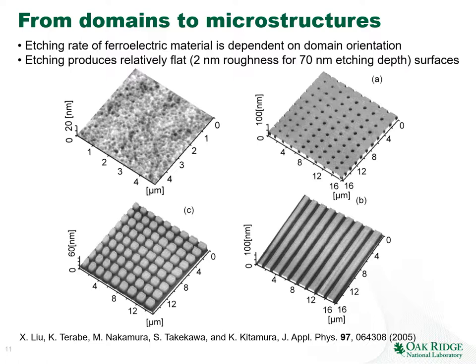This is an example of several configurations for photonic crystals and for diffraction gratings that were created by the Kitamura group using this approach. After a little bit of experimentation, they were able to find the etching conditions that produce reasonably flat surfaces for a pretty large etching depth.